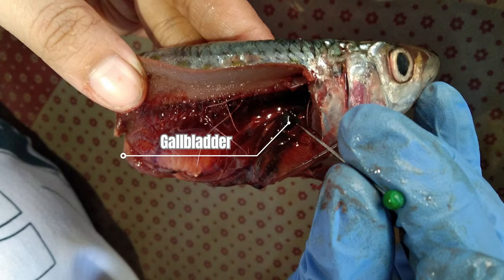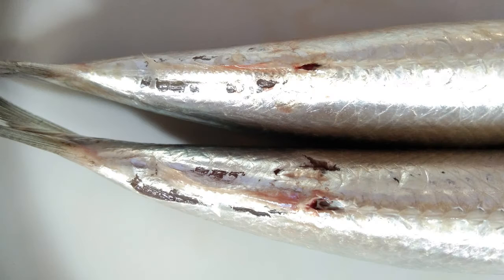And this is the gallbladder. The liver produces bile which is stored in the gallbladder until a bolus passes the stomach, at which time the bile is expelled into the intestine. Bile contains waste products of liver activity which pass out of the fish in the feces. Lastly, the anus is where the waste exits.